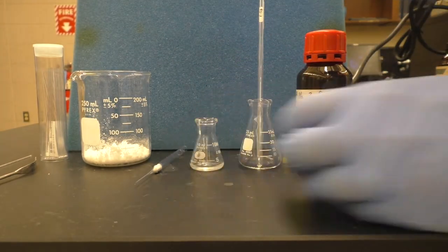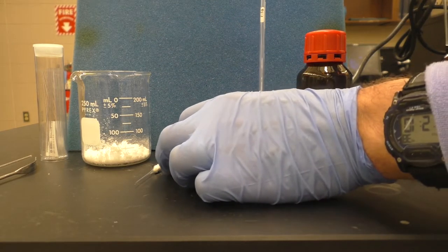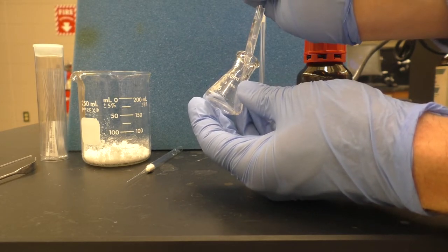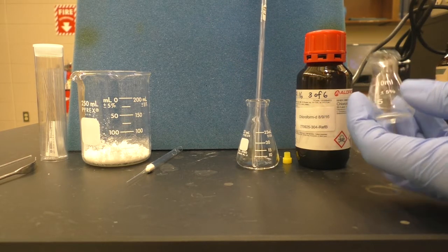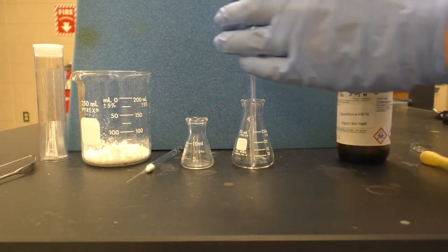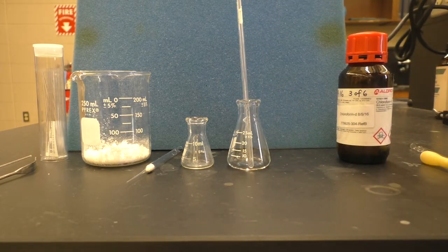If there were more insoluble material, then I would need to use the filter pipette, which I prepped in case. I'll now transfer this into the NMR tube. Cap the NMR tube here. And then I'll set this aside to do a crude NMR after I have finished with the recrystallization and gotten some pure crystallized material to do a purified NMR for comparison.